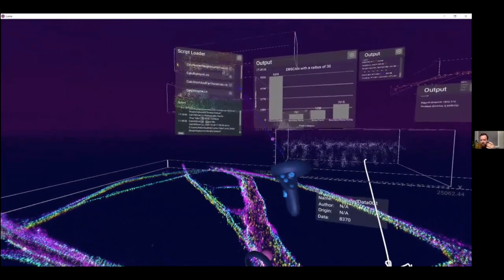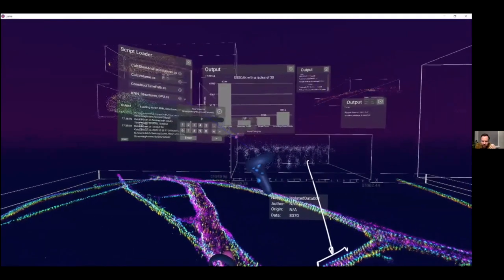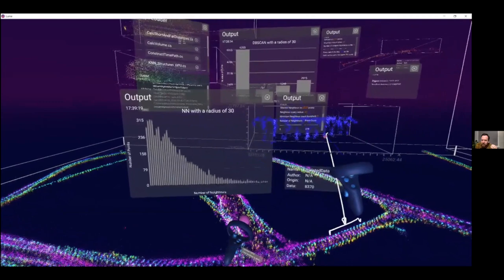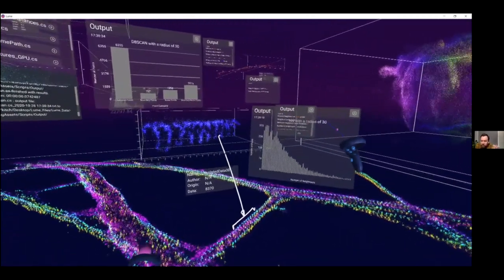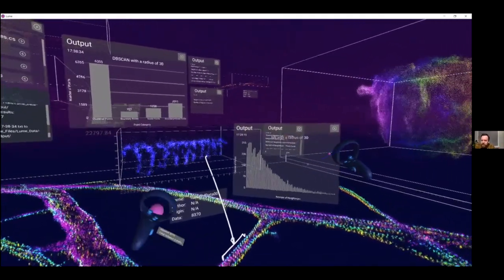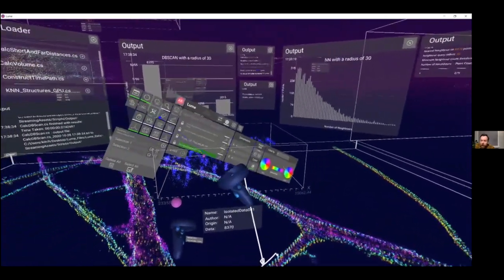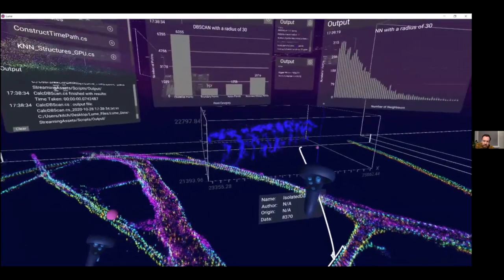And actually, with these three-dimensional data sets that we have, it's very difficult to take a 2D picture and really get the intricacies of what we're actually viewing. And VR, I think, does provide a unique opportunity. What we did find was that literally everybody, all of my graduate students who've been taking these kinds of data, when they first examined their own data that they're very familiar with in virtual reality, nearly all of them were blown away and saw something new that they hadn't seen before, even though they were really familiar with looking at that particular data set.